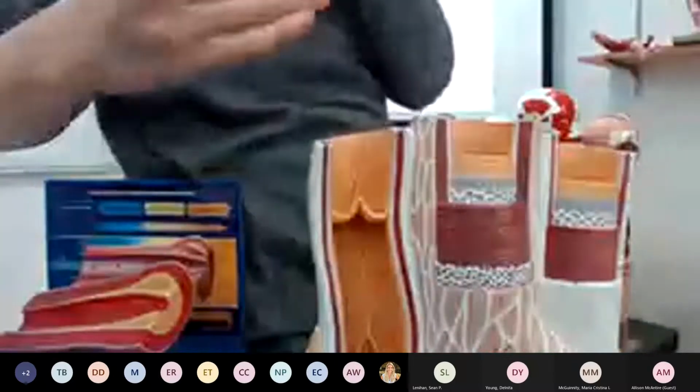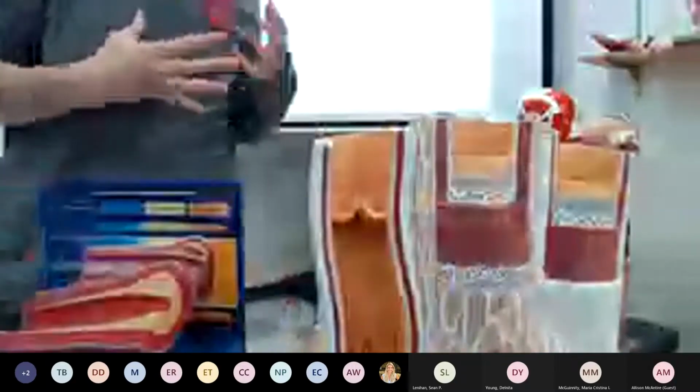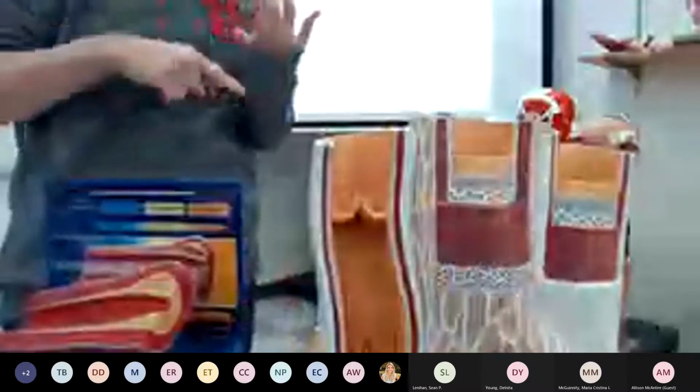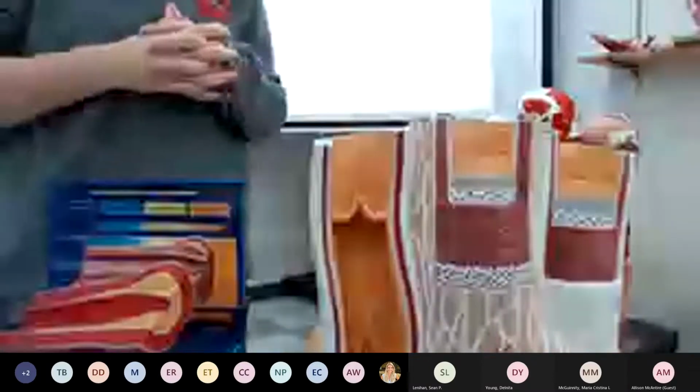Okay, all right. Now, moving into between these smooth muscle cells, there will be a little bit of areolar connective tissue because these smooth muscle cells do need room for capillaries to come in and provide them with nutrients. And again, as the muscle cells are going to squeeze and contract, they're going to be pulling on some of the connective tissue in front and behind them and a little bit in between.